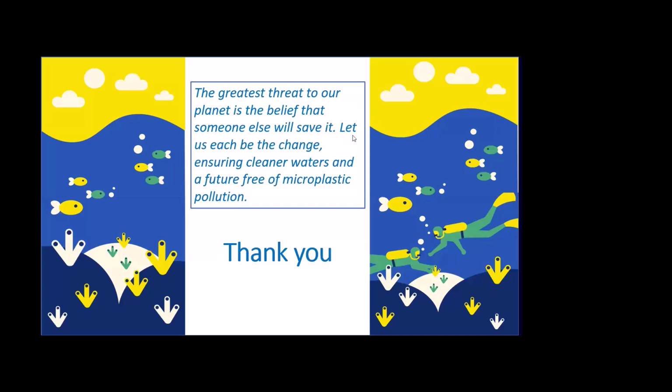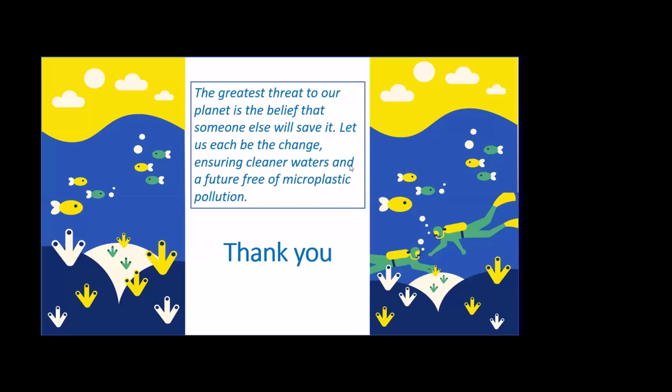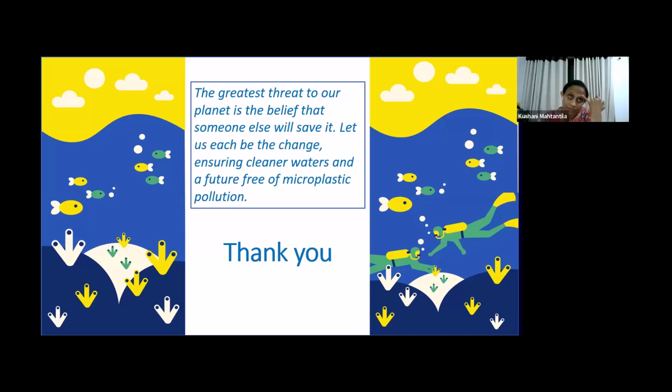How much sample is needed to collect water for microplastic identification in groundwater? As I mentioned earlier, if we use the spectroscopic method, you can handle a large volume of samples, even though the particle number is high. If they are clogging, you can take another filter paper, but it is recommended to use at least 1 cubic meter.